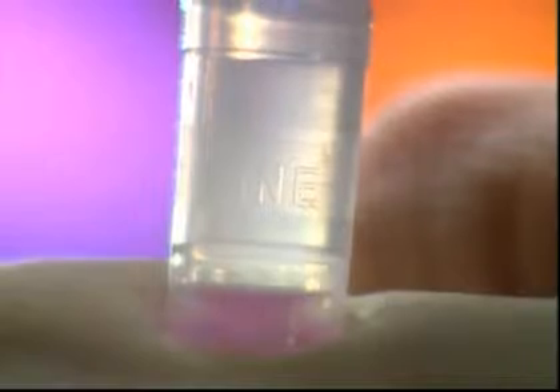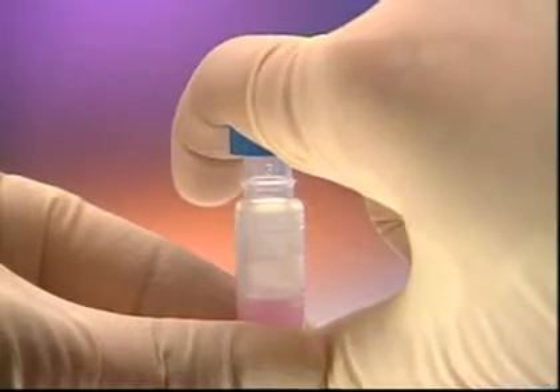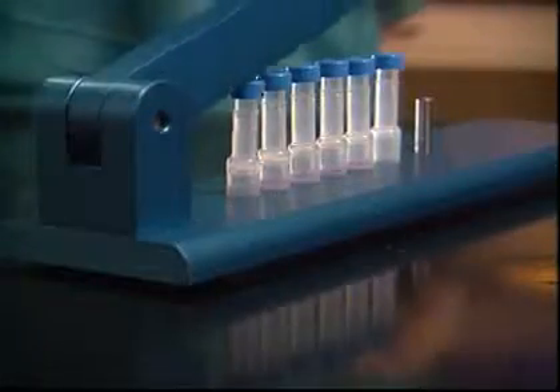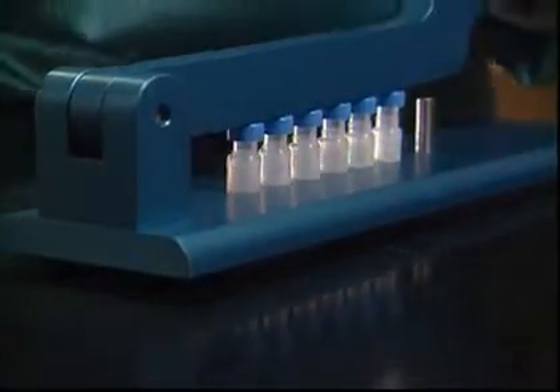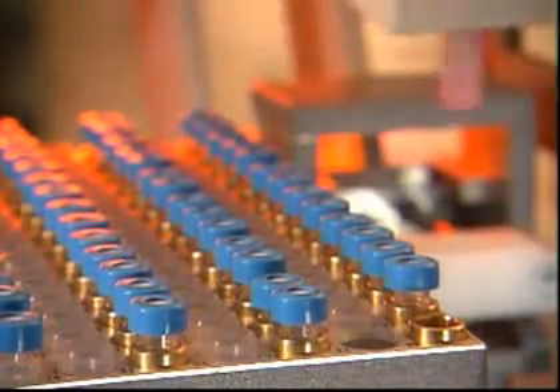The filtered sample is now ready for HPLC, three times faster than with traditional methods. Samples can be compressed individually by hand for small numbers of samples, or with a hand compressor for medium numbers of samples. Mini-UniPrep is also automation ready for 24/7 high-throughput labs.